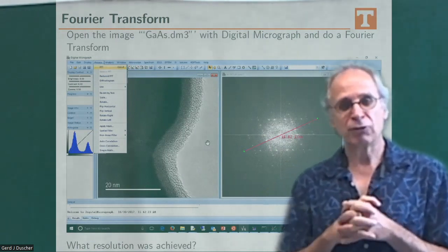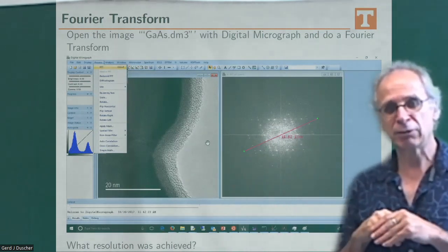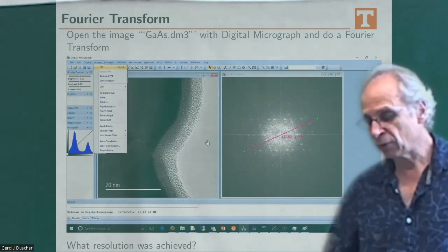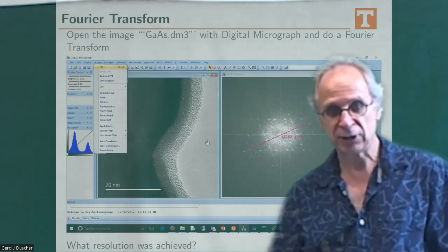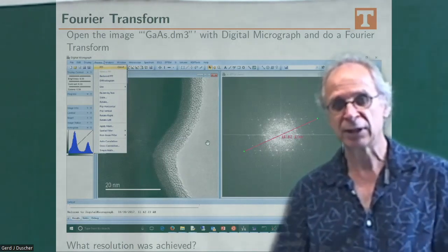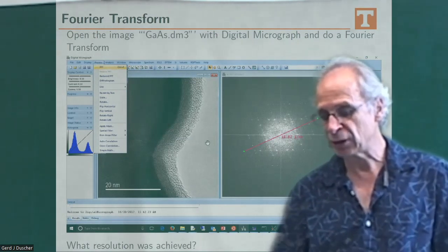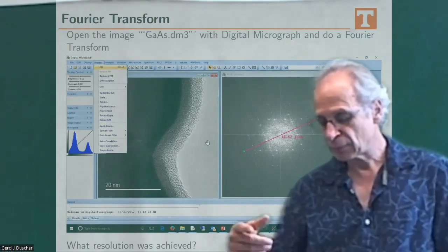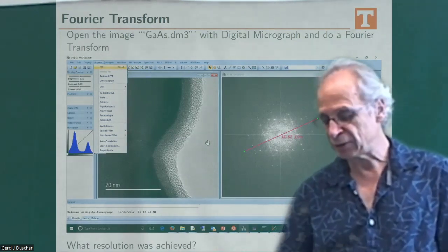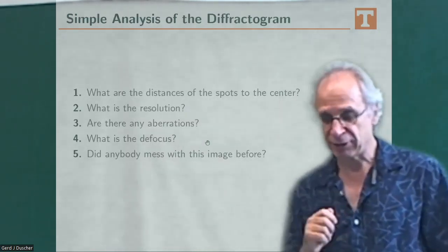So in physics, you have an additional factor of 2 pi that would be playing a role here. So depending on how you calibrate that, you have differences here, but for microscopy standards, we just ignore the 2 pi factor. And so the 2 pi was introduced to show that there is a circular dependency of the waves, right?